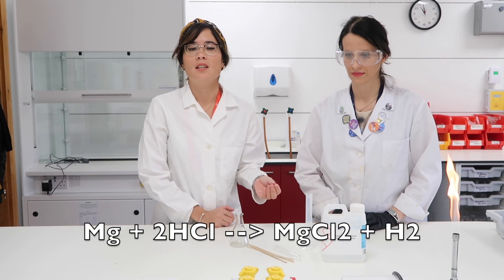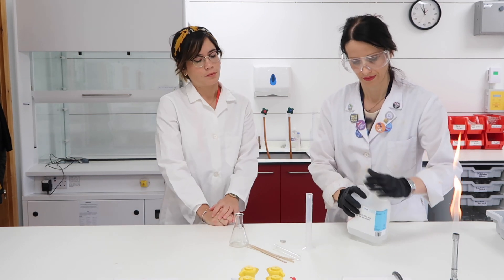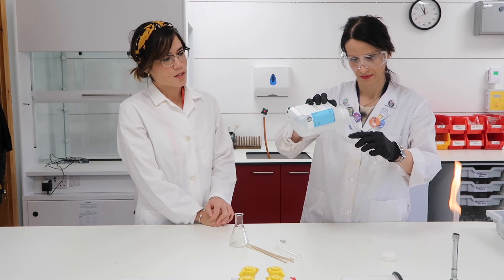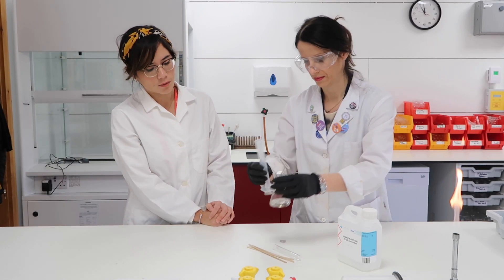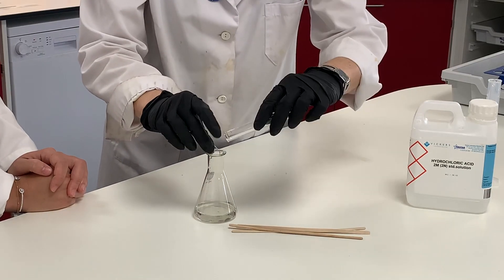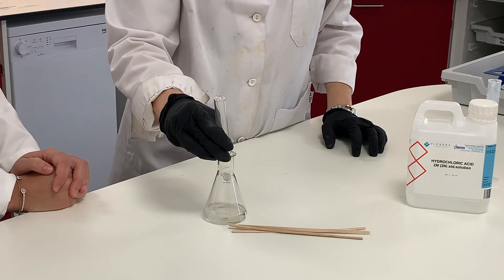Because hydrogen and magnesium chloride are produced, Amelia is adding the hydrochloric acid to a measuring cylinder, then she transfers it to a small conical flask, and finally she's adding the magnesium ribbon, which reacts immediately.